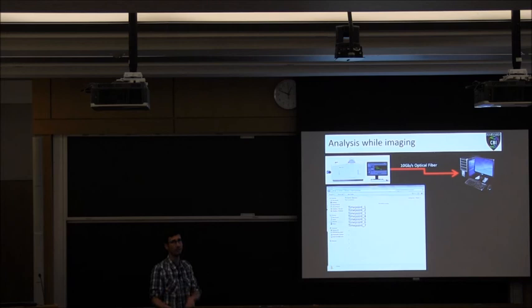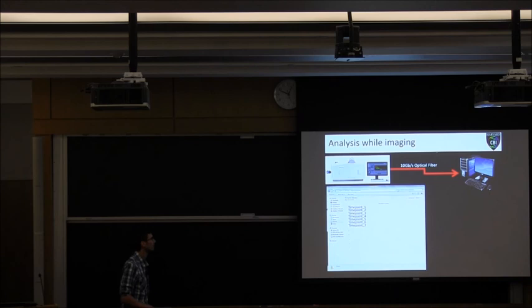There's a little program now that can run in the background, and as soon as you've done a time point or as soon as you've done a tile, that little program sees that file sitting there and it immediately converts it to the SIS format. Okay? So by the time that you're done acquiring your image, you've already got your file converted into the SIS format. Okay? That's one example.